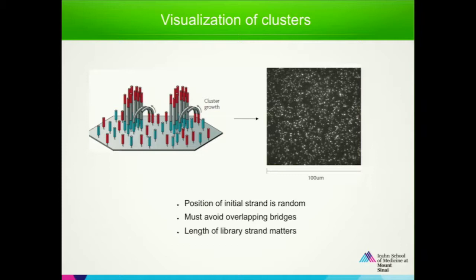If you are sequencing from this end to this end, they say it's read number one. If you're sequencing from this end to this end, they call it read number two. It's called single end, or paired end, reads. When you're analyzing the DNA-seq data, you know about single end and paired end reads, right? So this is where the terminology comes from. These are the clusters. And this is very interesting: a bioinformatics person or anybody may say that I have 1 million reads or 100 million reads.